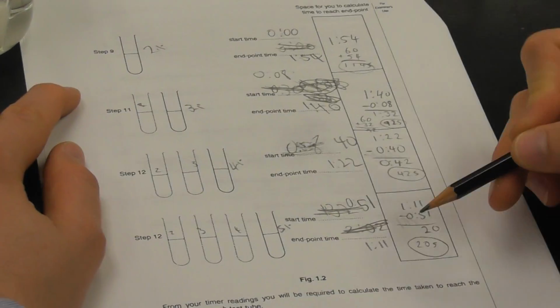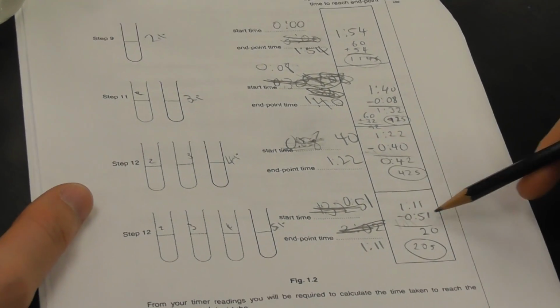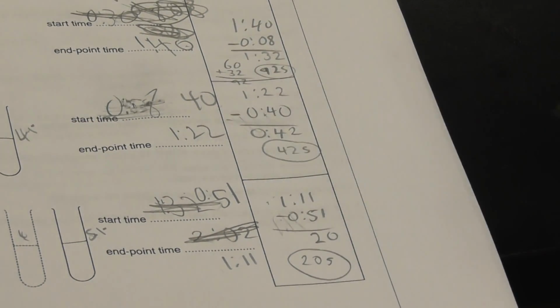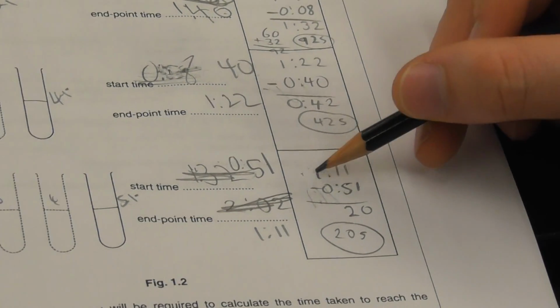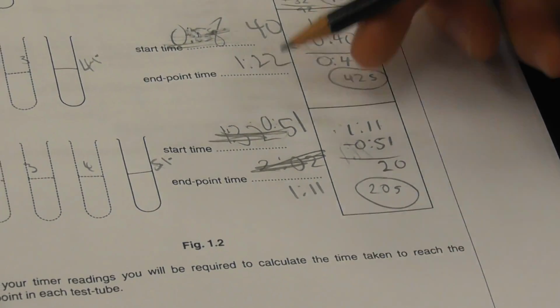Now, in order to do my math, here's what I do. I take my start time, and I subtract that from my end time. I have my T final minus my T initial. So I have 1 minute and 11 seconds minus my T initial. So I have 1 minute, 11 seconds minus 0 minutes and 51 seconds.